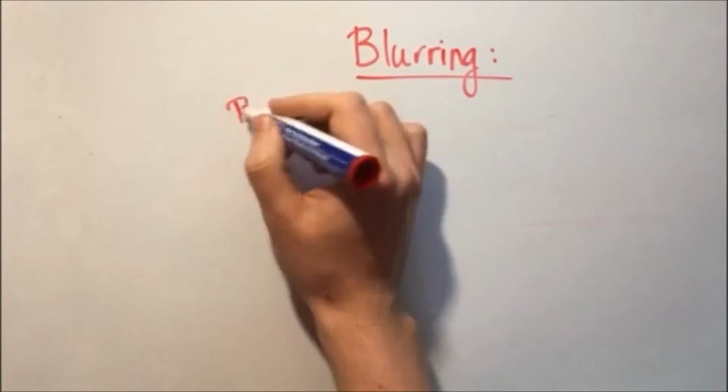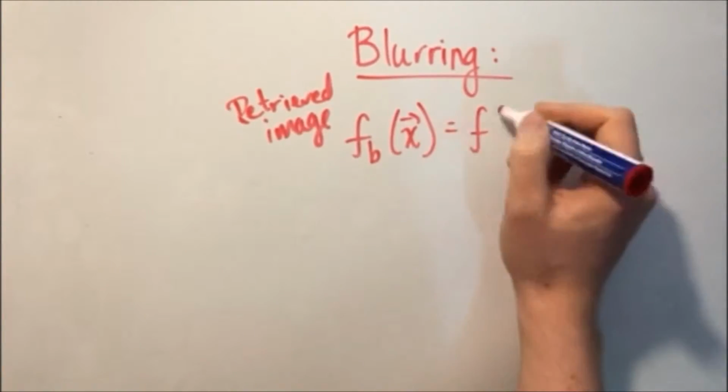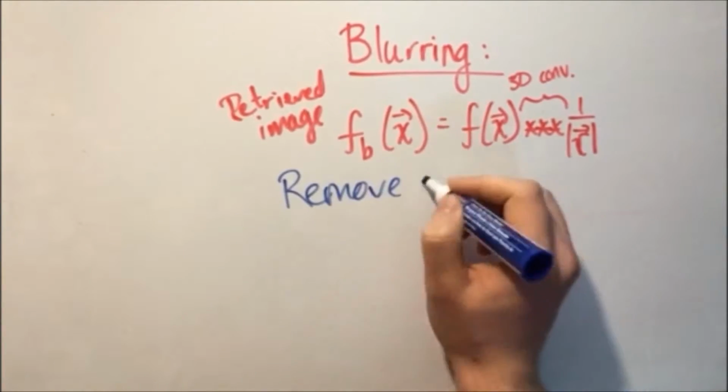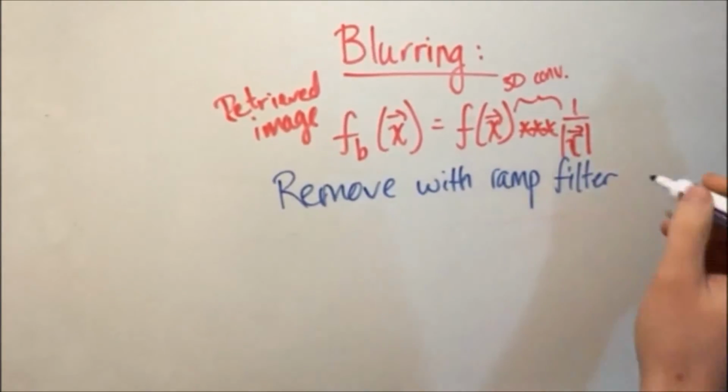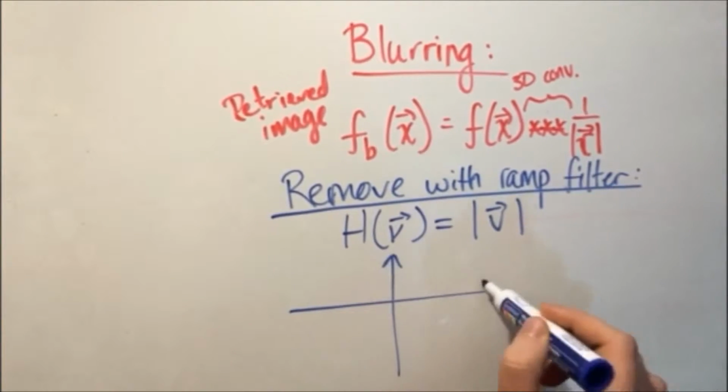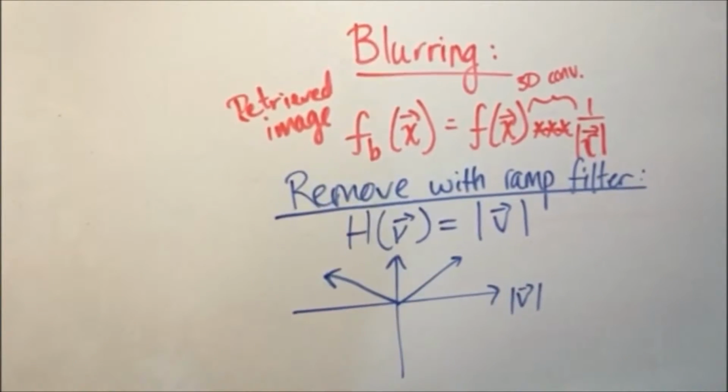We can't just naively backproject our image because the resulting 3D image will be blurred. In order to remove this blurring, each projection is sent through a ramp filter and then backprojected in a process called filtered backprojection. The resulting image has a much higher resolution, though some slightly exaggerated edges due to the high-pass nature of the ramp filter.